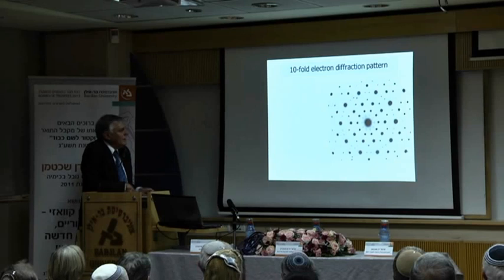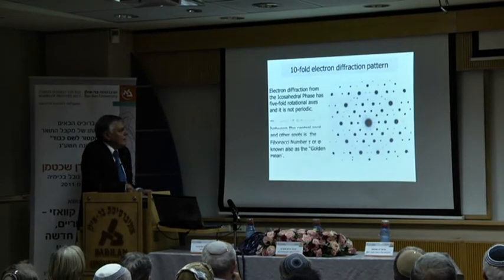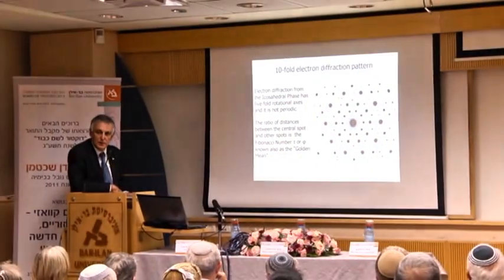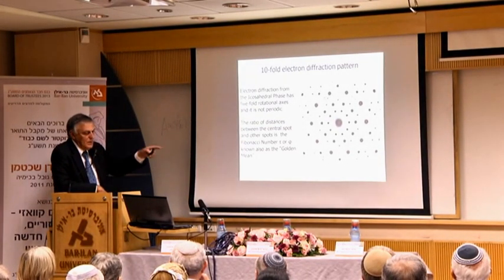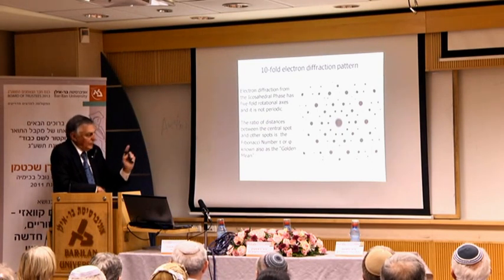You see, there is no periodicity here. This structure has a tenfold rotation symmetry. Later on, it was found to be fivefold, but I could not tell by this image. I needed to do another experiment called Kikuchi pattern to know that this is really fivefold. But that doesn't matter.